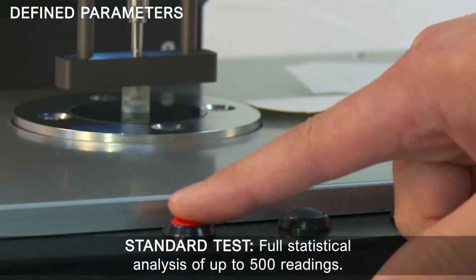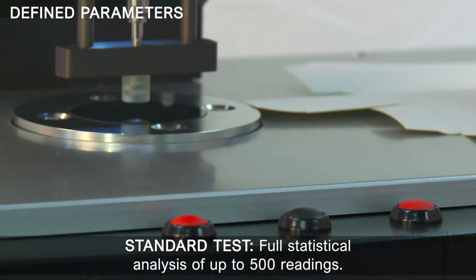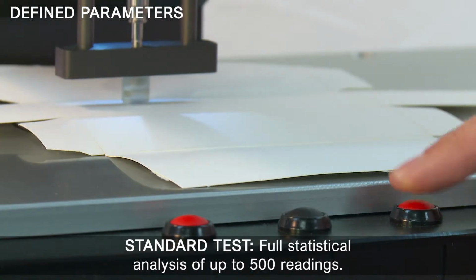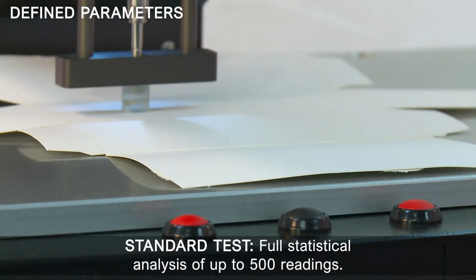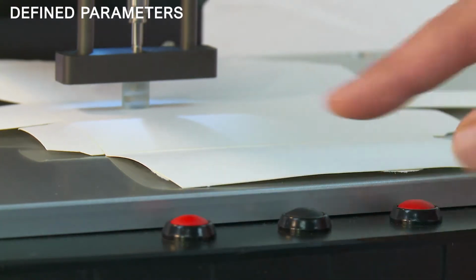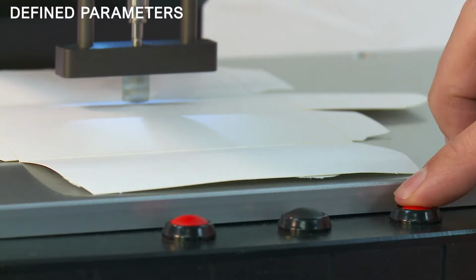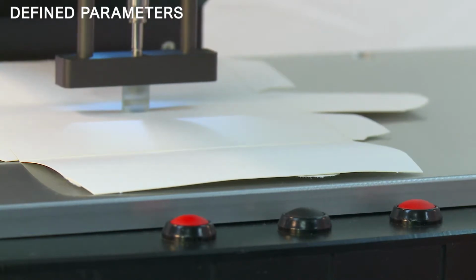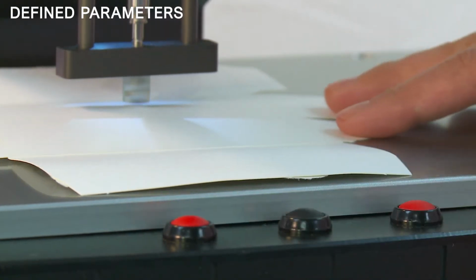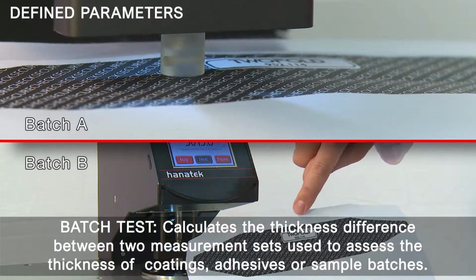Test types. Standard test. Full statistical analysis of up to 500 readings. Batch test.